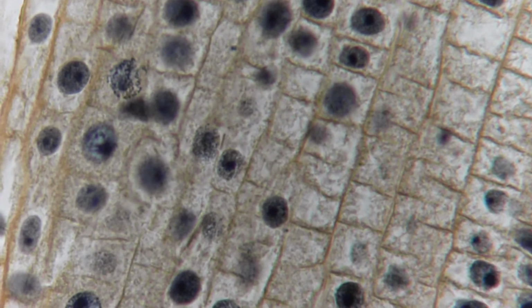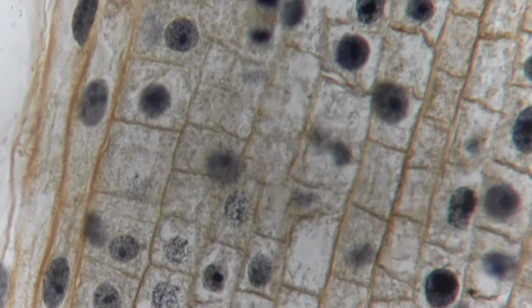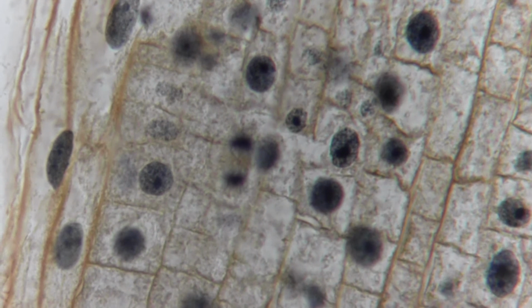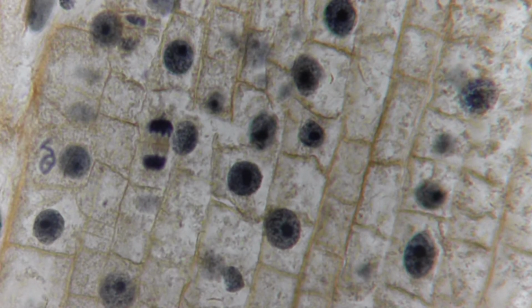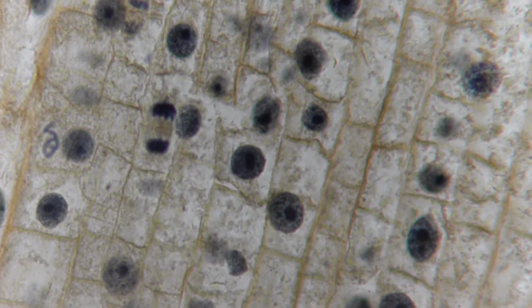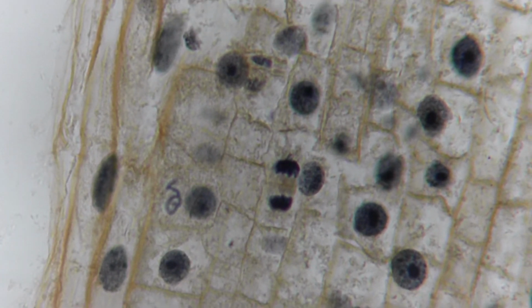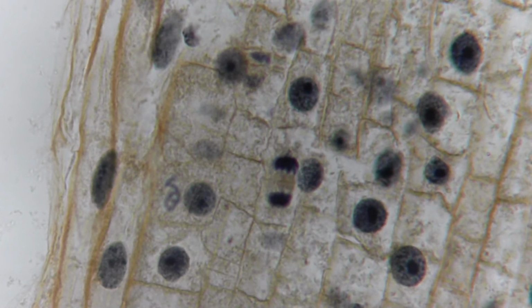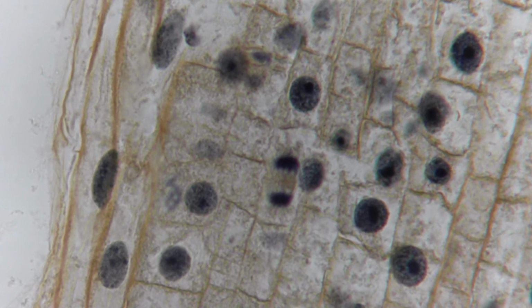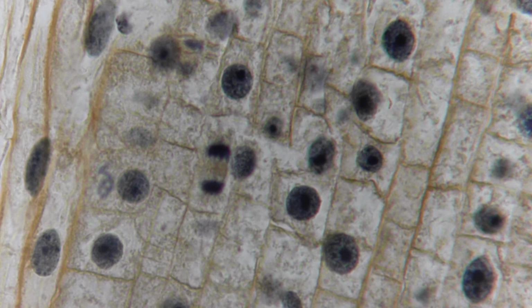And then go up. Okay, here are those tighten little things. Let me get it focused better. Okay, now let me move it to the center. Okay, I'm going to focus up and down on it. And the cell wall is kind of mutilated here, but the chromosomes are like picture perfect.